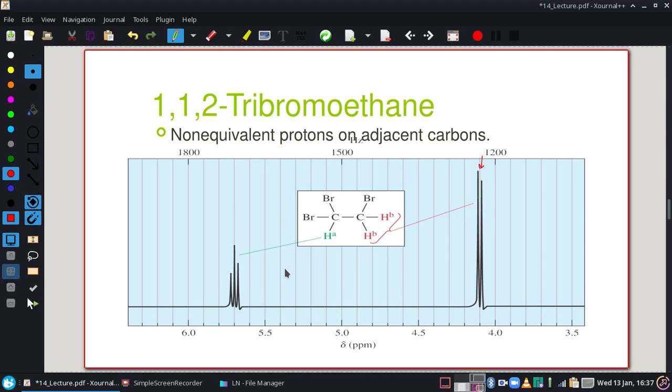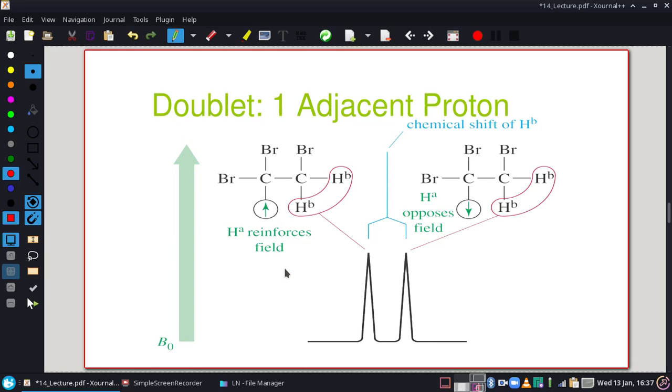Now, where that 2 and 3 come from, you actually see something kind of like this when we focus on what's going on. So these two protons, and they're the same in both these molecules, are showing up in the spectra either de-shielded because the nearby hydrogen enhances the magnetic field, or shielded because the nearby one disrupts the magnetic field.